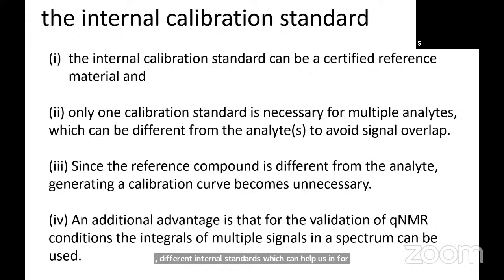Because if you go into the market, different types of samples, heterogeneous samples, are now analyzed. So for them, not all internal standards are suitable. So we are also doing research work on that. Internal standard can be used. The qualities that are needed for internal standards are the same as the qualities that are needed for a primary standard that we see in our pharmaceutical analysis.